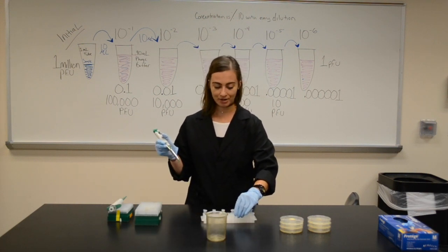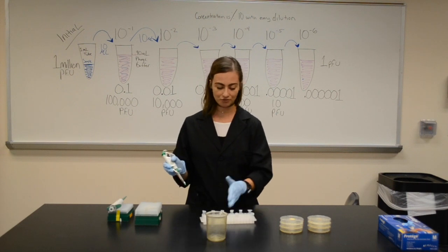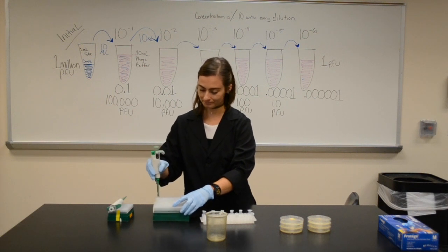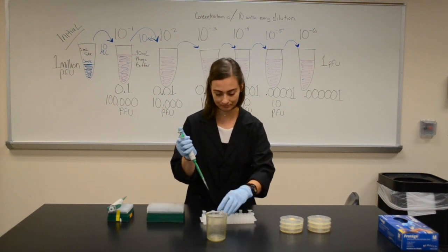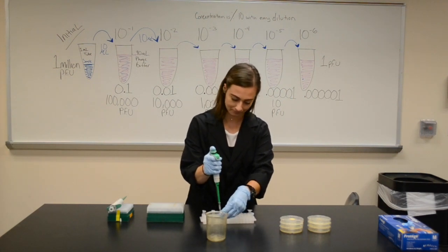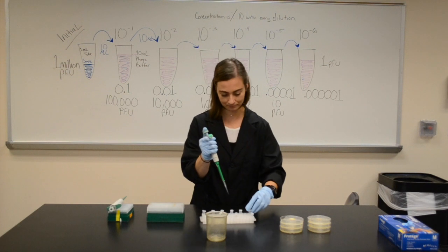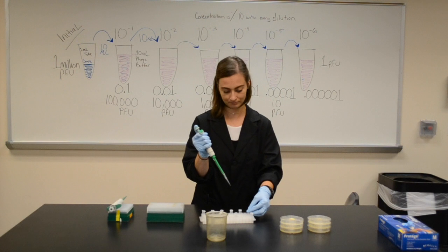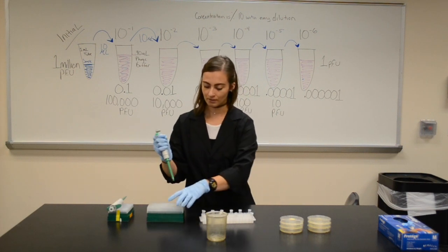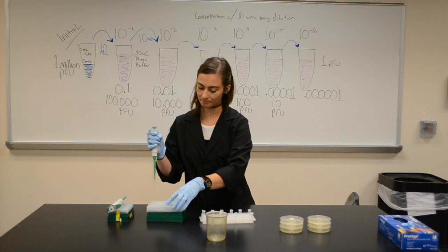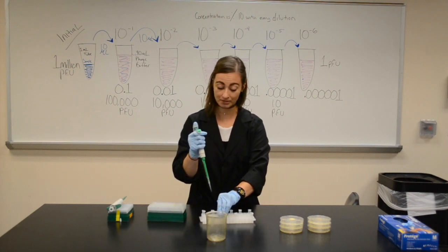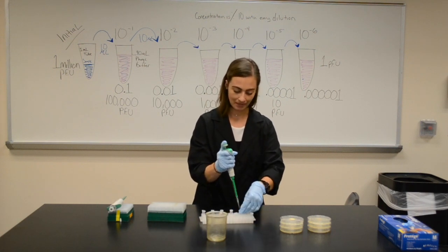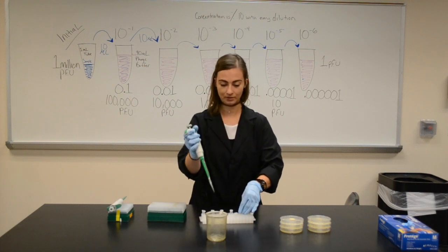First, I'm going to have my phage buffer and I'm going to fill each of my containers with 90 microliters of phage buffer. It's important to change tips. You want to keep everything sterile and free from contamination. Remember, even though I'm talking right now, you won't be.